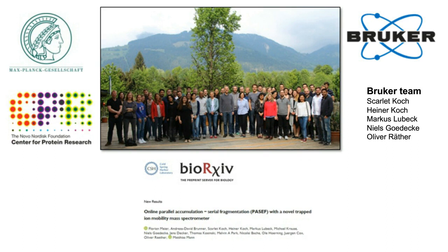Where can I get the latest MaxQuant version? I didn't provide the link, but the best way to get the latest MaxQuant version is really to go to Google and type MaxQuant download. The first hit will bring you to the download page, and it's actually only the latest MaxQuant version which you can always download.